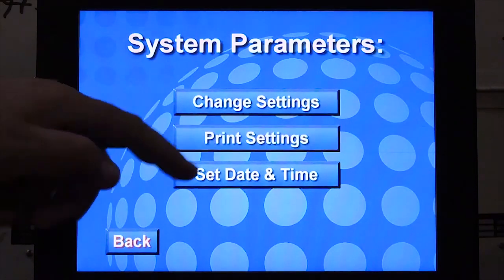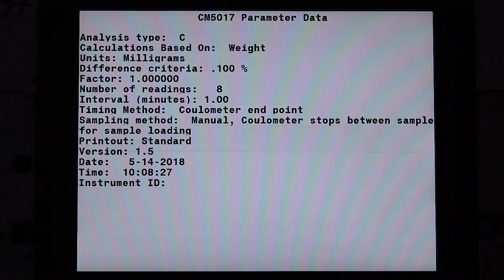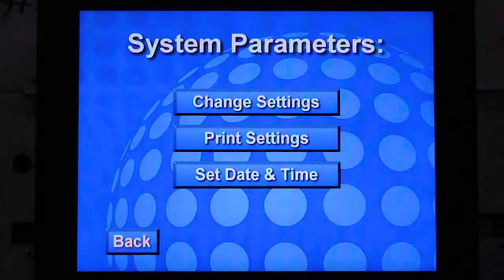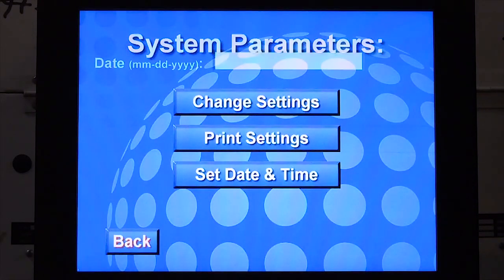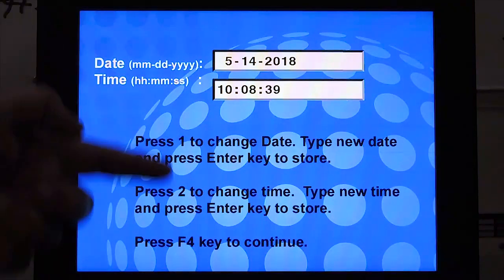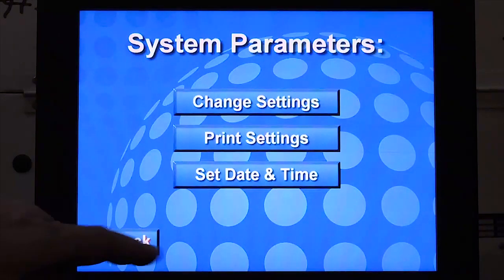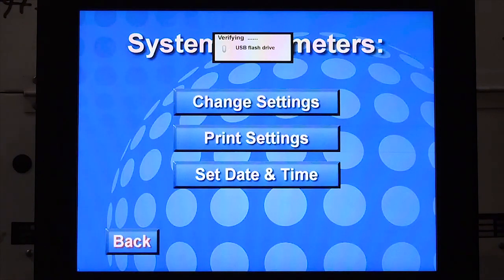Print settings. Even if the printer is not attached, you can select this to view the parameter data. Press F4 to get out. Setting date and time: press 1 to enter the date and press 2 to enter the time. Press F4 to return to the system parameters page and press back once more to save all the changes on the USB.